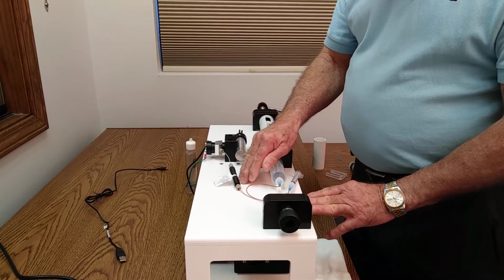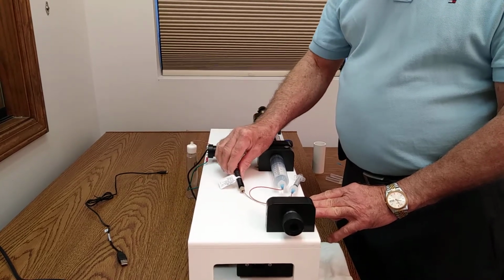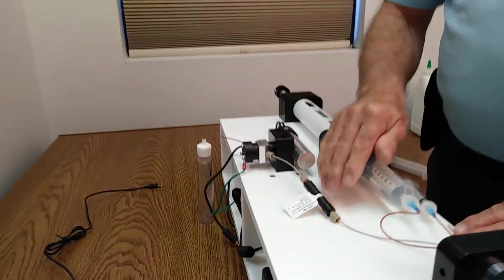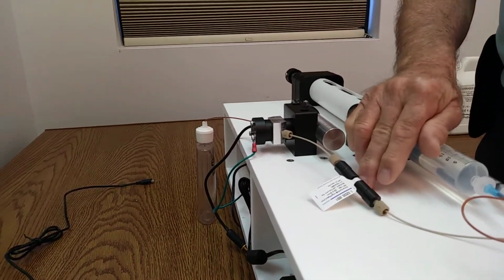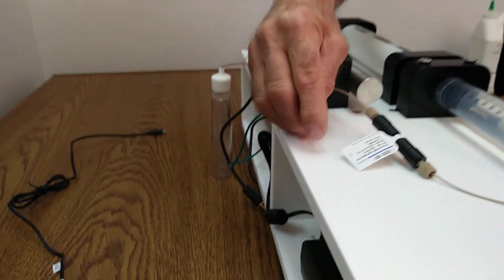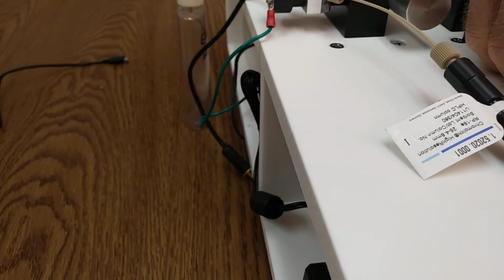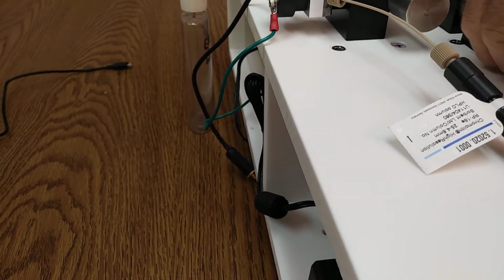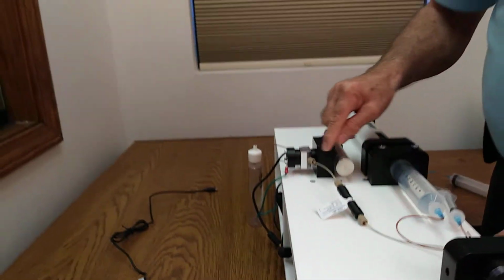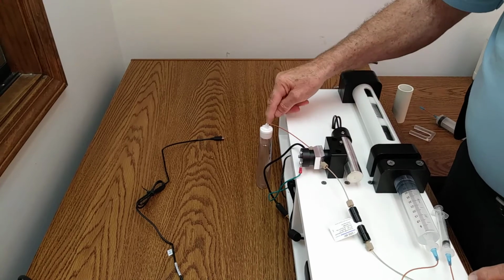The next component of importance is the column. You can argue that this is the most important part of the system because we are dealing with separation science, and this is the place where the separation occurs. There is an arrow on the label indicating the flow. We're flowing in the direction of the arrow. It is not critical. You can flow backward, but why not follow the rules? So we flow out of the column into the flow cell of the detector, out of the flow cell into waste.